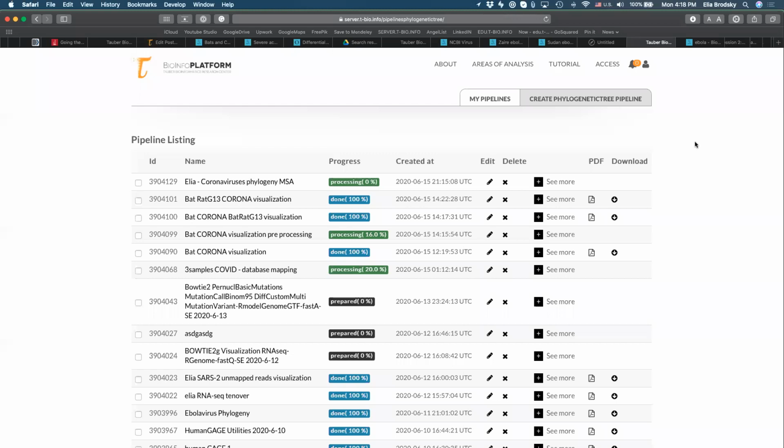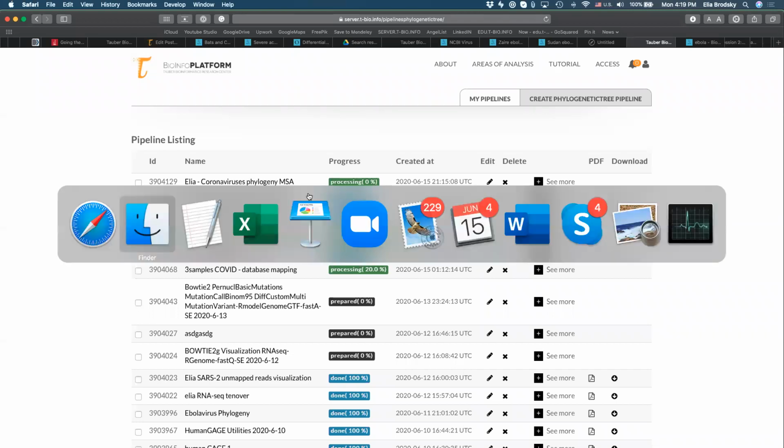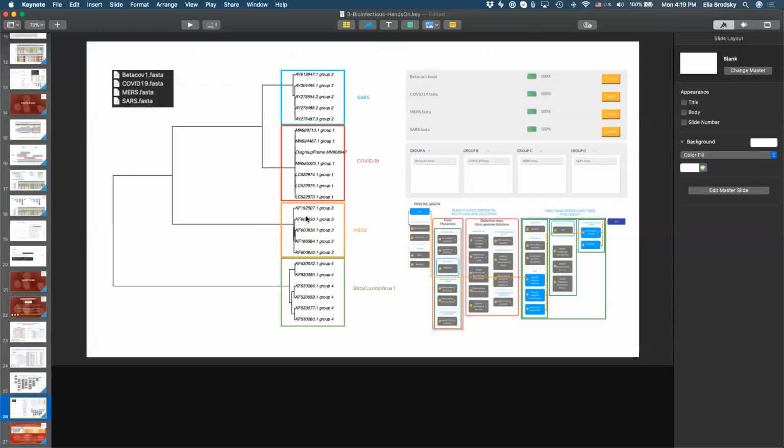Like I said, for next time, we're going to be reviewing the outputs, and the goal is to be able to actually reproduce this for your own data and see how the different steps play out in the results. So if you would like to review this again next time, please try and do this before we meet next time on Thursday. Again, you will have to wait a little bit for that outcome. It's not going to be just a few minutes and it's done, and it's going to go in a queue. So those of you that started first will get your results first. Just remember that there are going to be some delays as you do this.